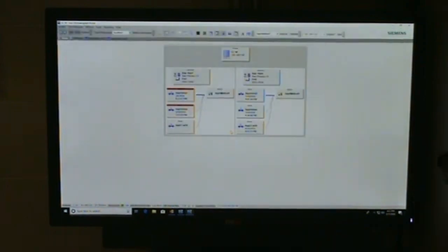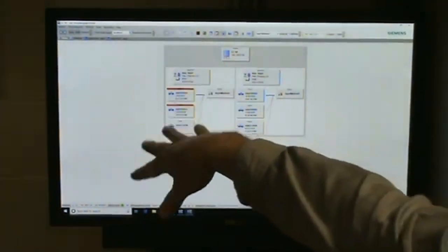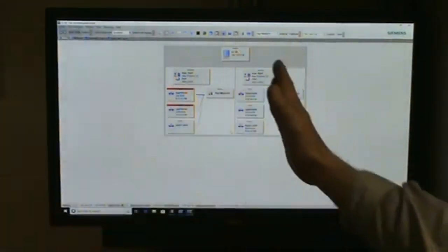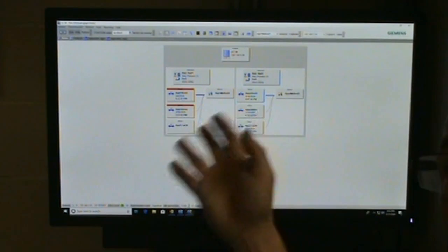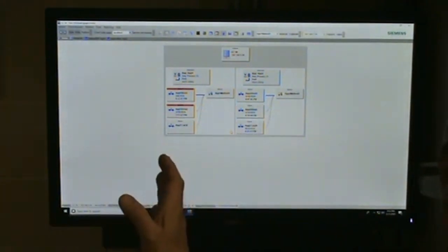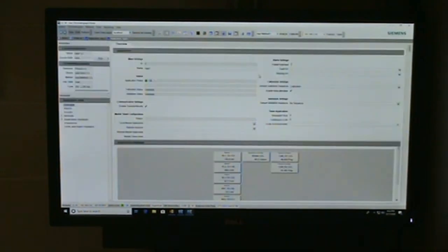We have two apps. Remember, we have two apps. The right-hand side is app 2, the left-hand side is app 1. We are using this app to do our looking at the valves. This side we are actually running. We have two different sets of detectors that we are playing with. We have the right and the left. We are using those to do heavies and lights. So it's basically two GCs on this app. We are in hold at this point in time.